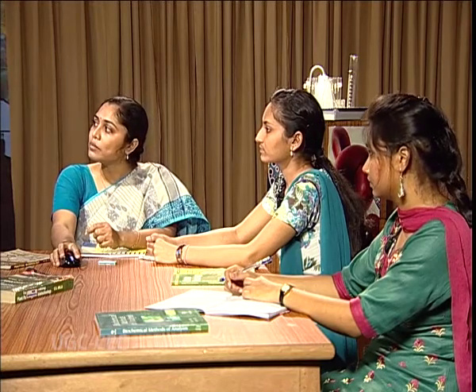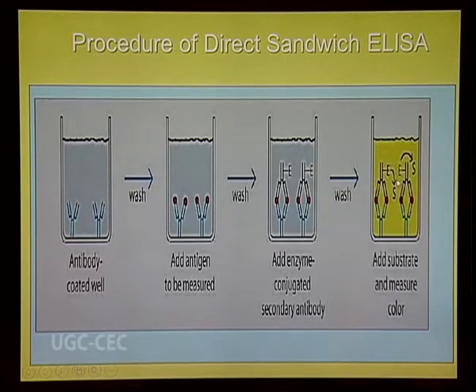And this is an example of direct sandwich ELISA, since the antibody which directly binds to the antigen is tagged with an enzyme.